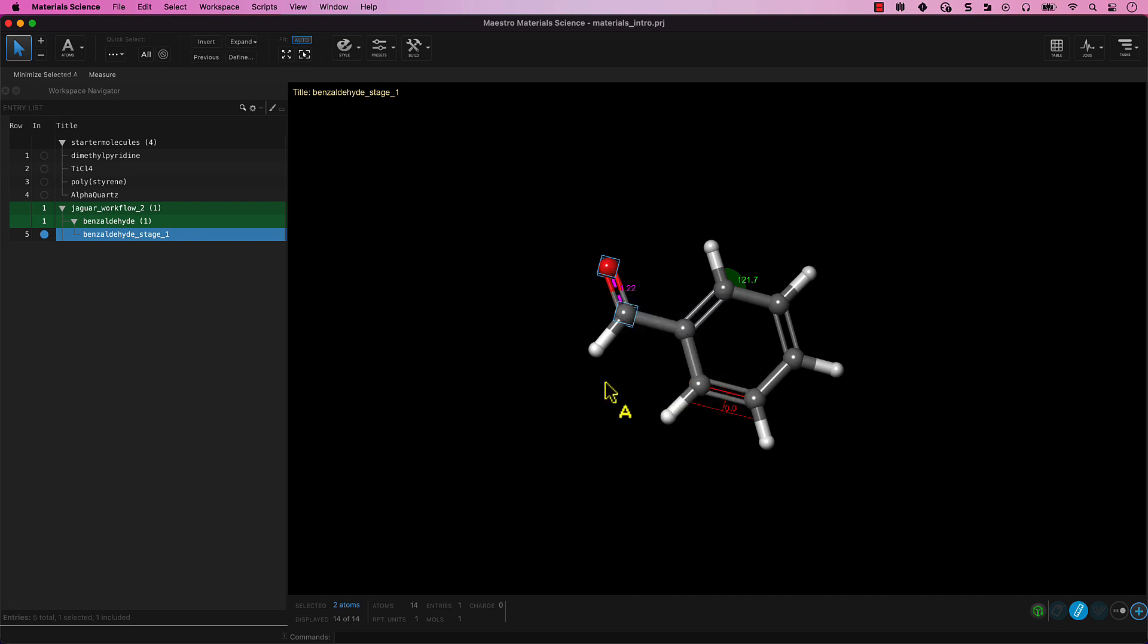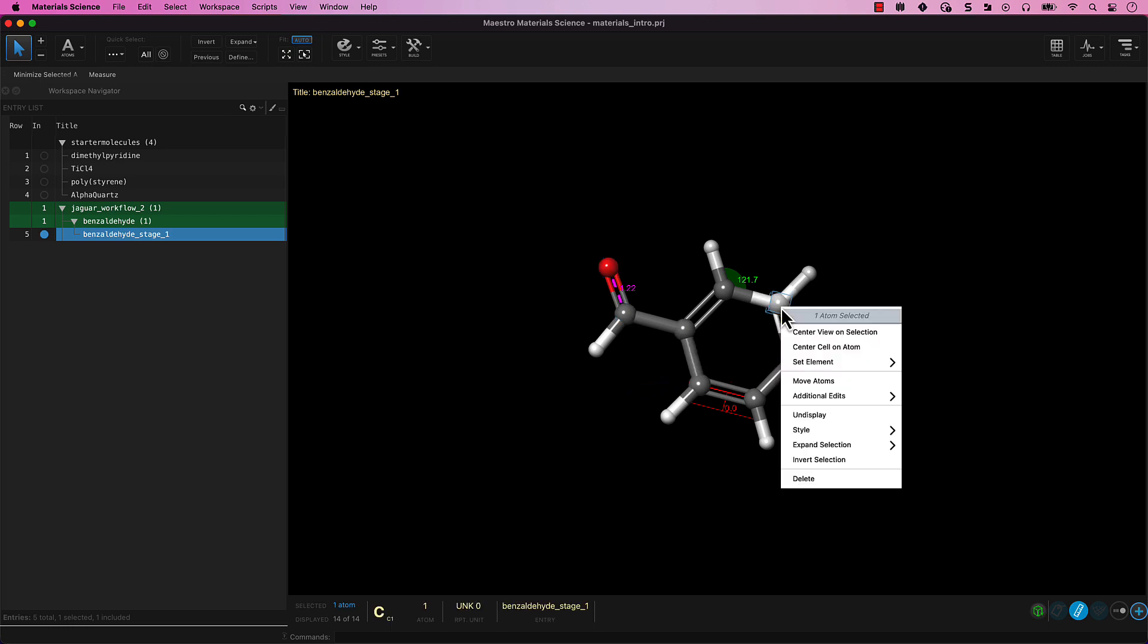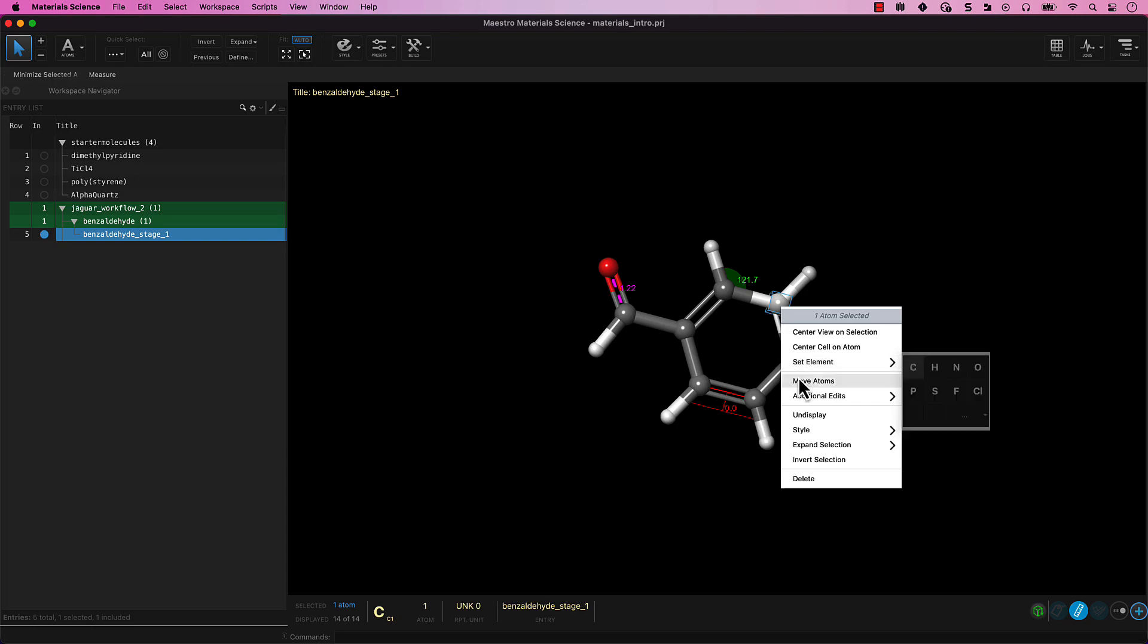Second, note that you can right-click on a single atom to change that atom to another element, set a charge, or change isotope, for example.